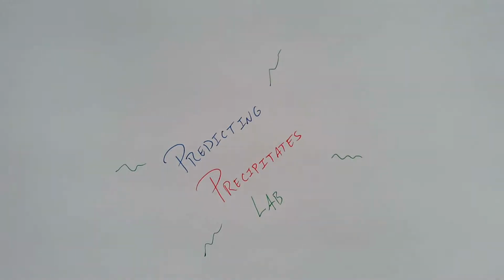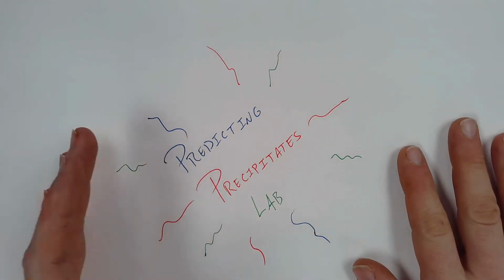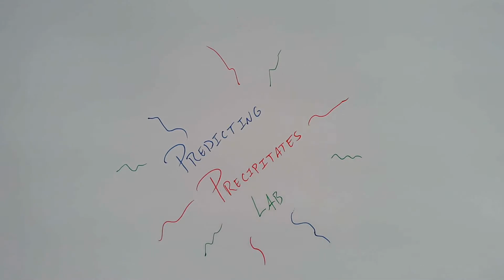All right, so it's time for the Predicting Precipitates lab. Woo! Okay, so realistically, today's lab is about figuring out if things are going to form, and how would you do a precipitate lab in practice? How would you actually test this stuff in a lab?